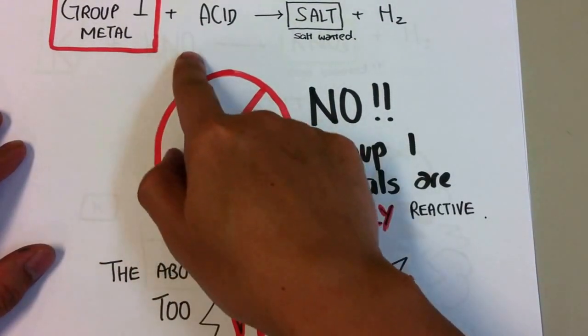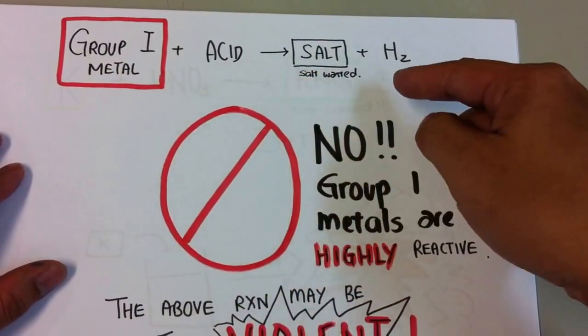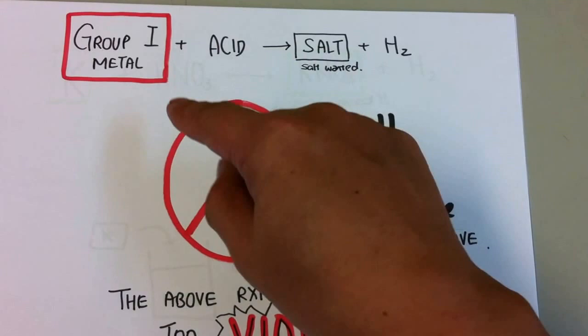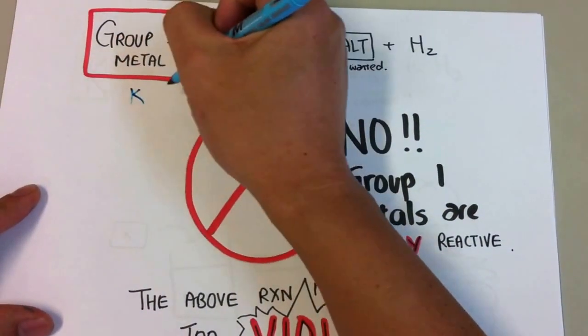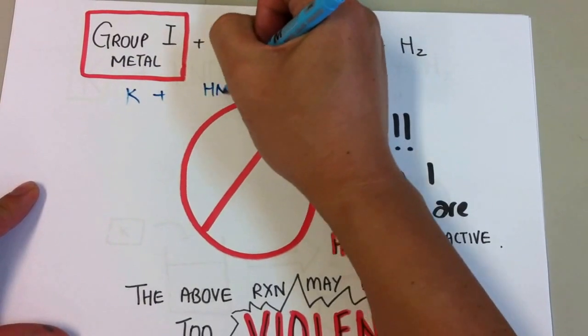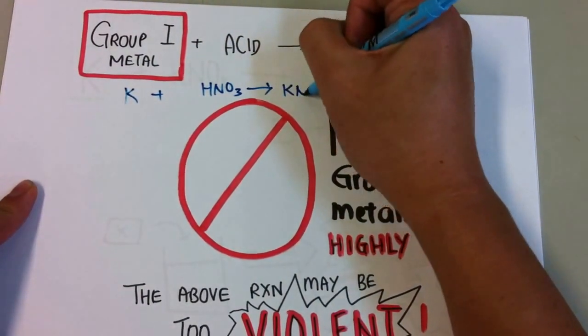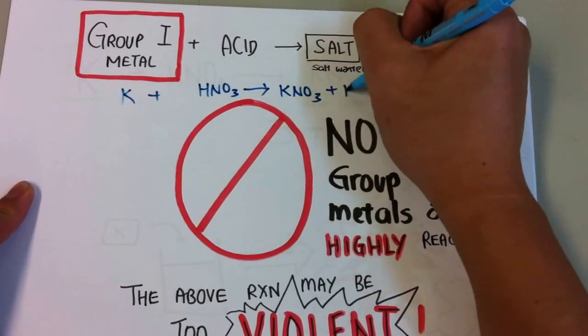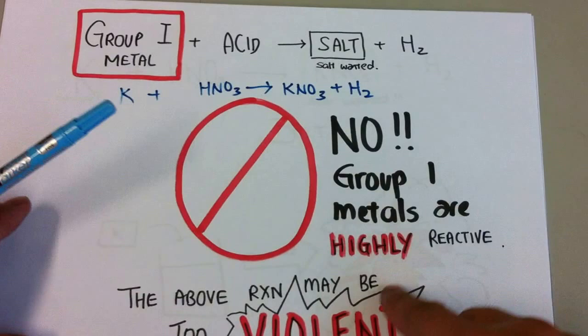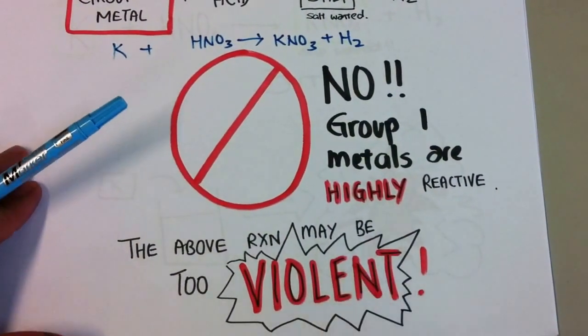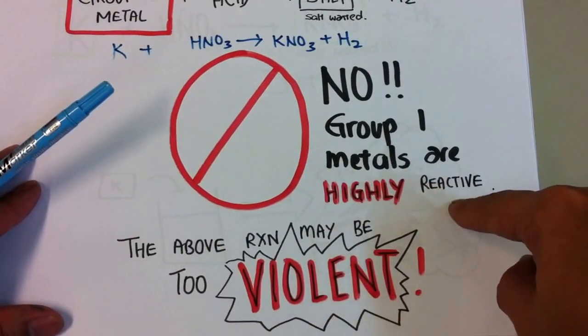When we want a group one salt, example, potassium nitrate, we would never do this. We would never put potassium plus nitric acid. Yes, the reaction will carry on. We will get potassium nitrate and hydrogen gas. But what you will get is a very violent reaction. We will get explosion because group one metals are simply highly reactive. Too reactive.